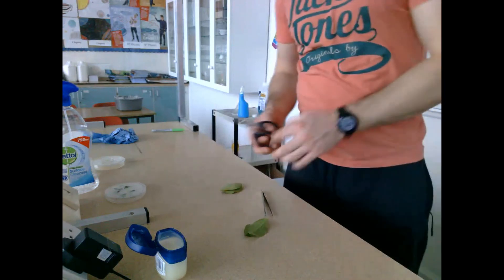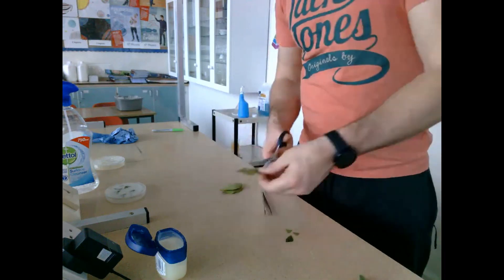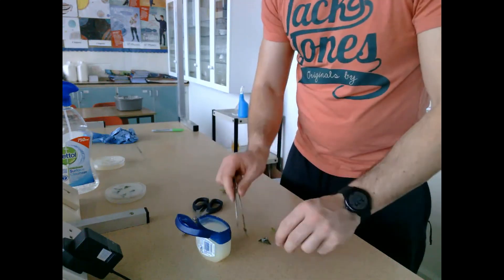Now I do the exact same process with the other two leaves — cutting each into small individual pieces, adding vaseline, then adding them to the surface of another plate. I repeat this with the third set of leaves as well.